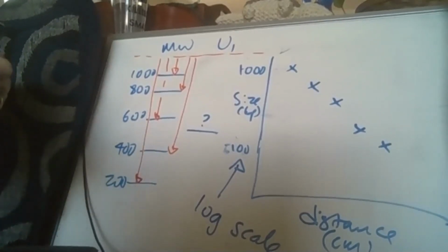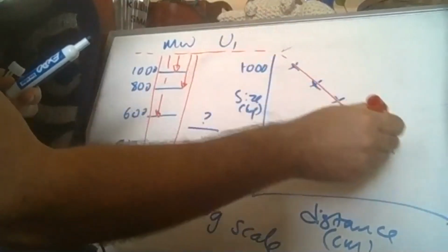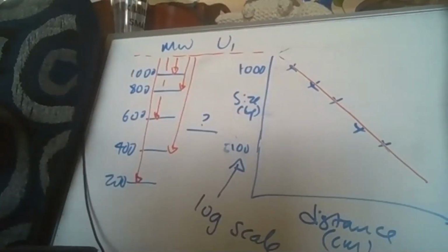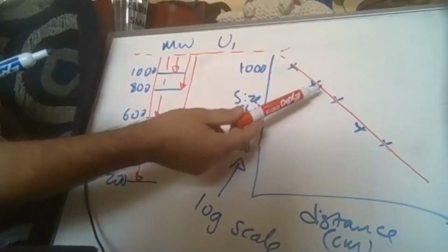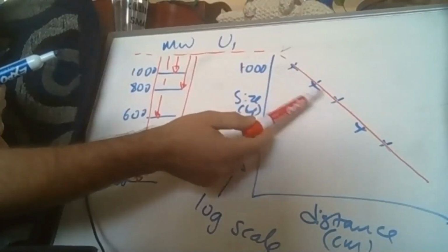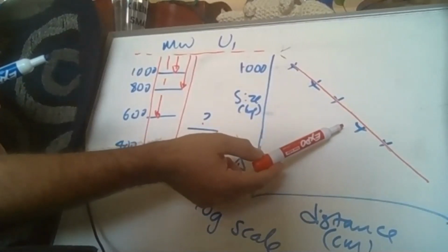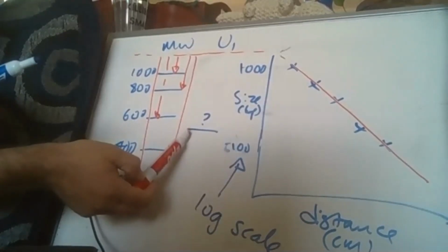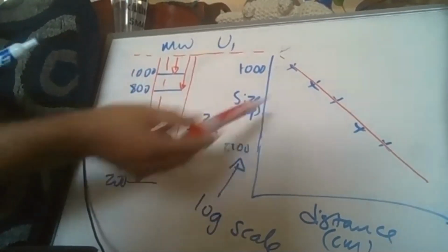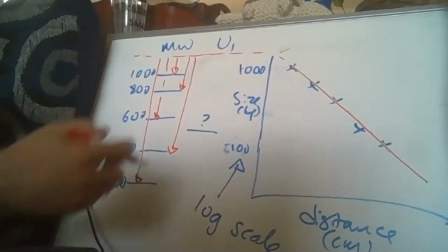Okay. Now you draw your line of best fit. Oh, that isn't too bad. Between those points, and it's kind of got to fit all of the points as best as you can make it. And so now you have values in between, right? So not only do you have these 5 different values, but now you have every single value in between those 5 to calculate your unknown. Because that's what that line is there for. It's like the relationship between size and distance, basically.